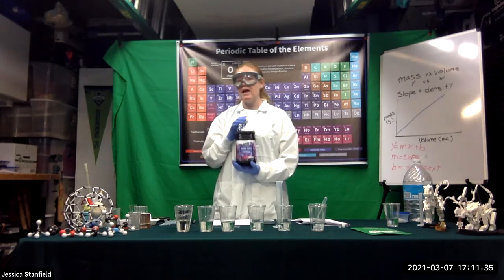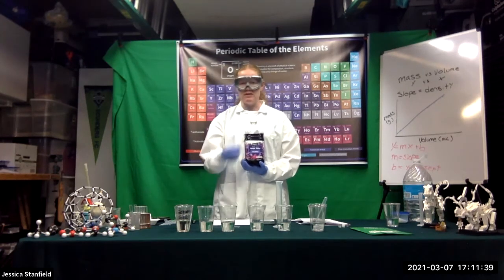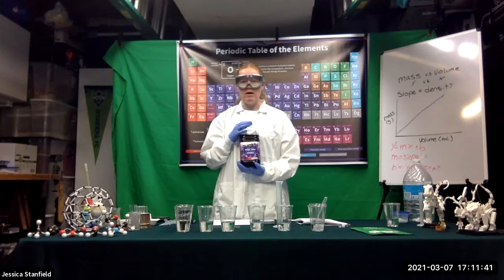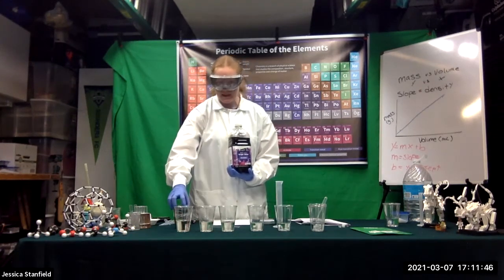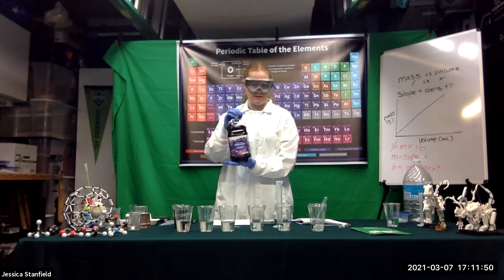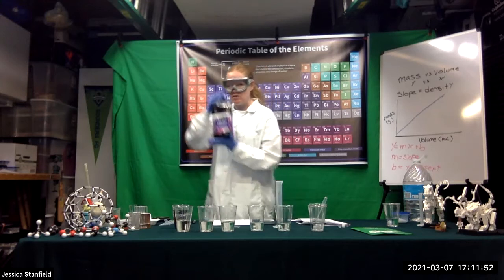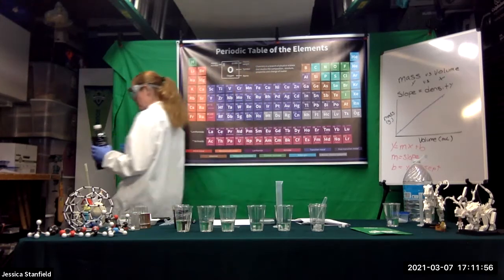So don't look at the percent on your beverage container and the percent that you get from this and think that you did something wrong, because this is going to tell you the percent by mass of sucrose. This tells you the percent of your daily value that you're consuming. So they're 2 completely different percents. So don't get confused by what's on the label once you get your percent from your experiment.